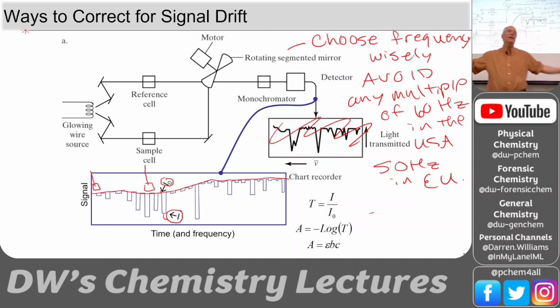The whole building is surrounded by wires all through the walls going up and down at 60 hertz electrically. And if your chopper's going at 60 hertz and you're trying to get I and I naught at 60 hertz, it's going to interfere with that. It's going to go berserk, and you will know it because your signal will be crazy. At some time it tries to get I and it's at a low point at 60 hertz and then I naught is up above, and other times they're reversed. And your spectrum is just going to be noise, but enormous noise.